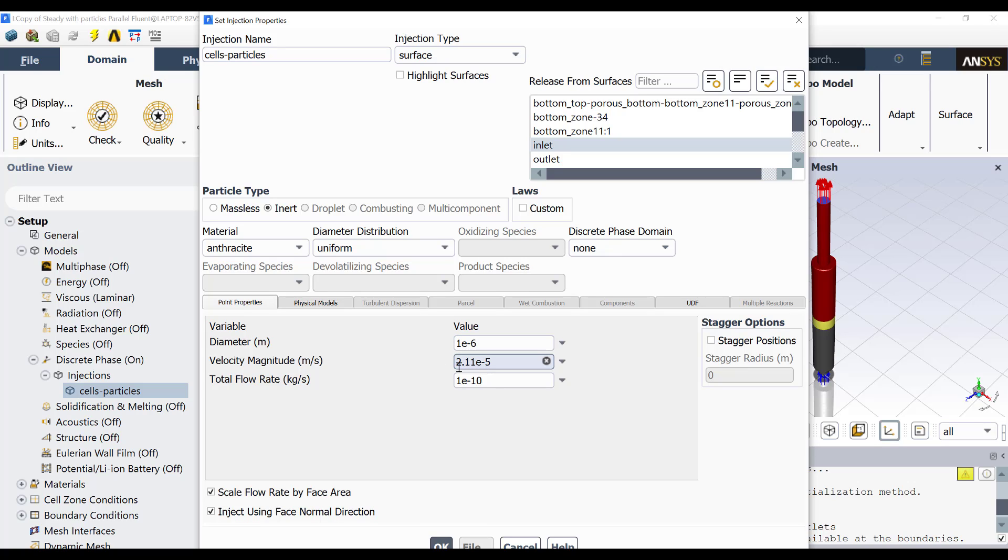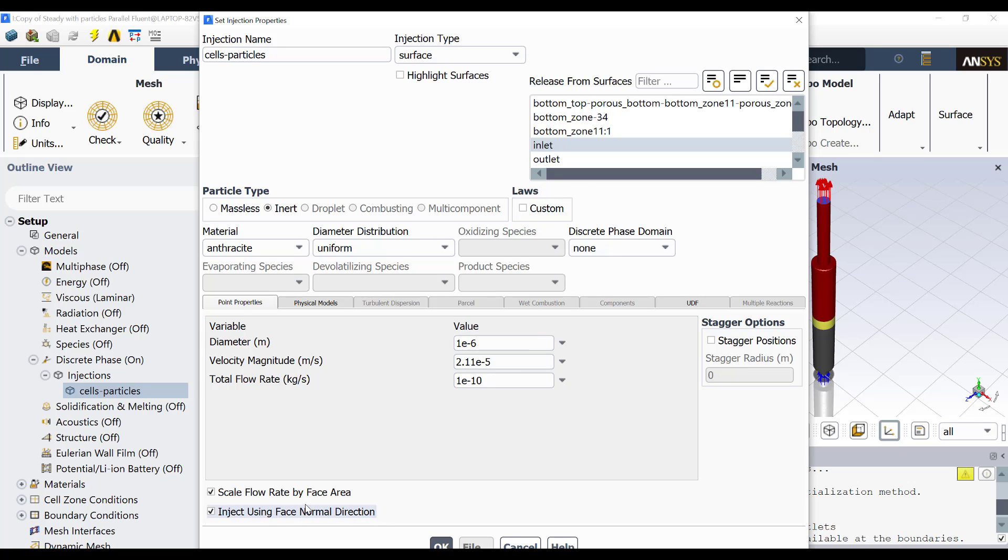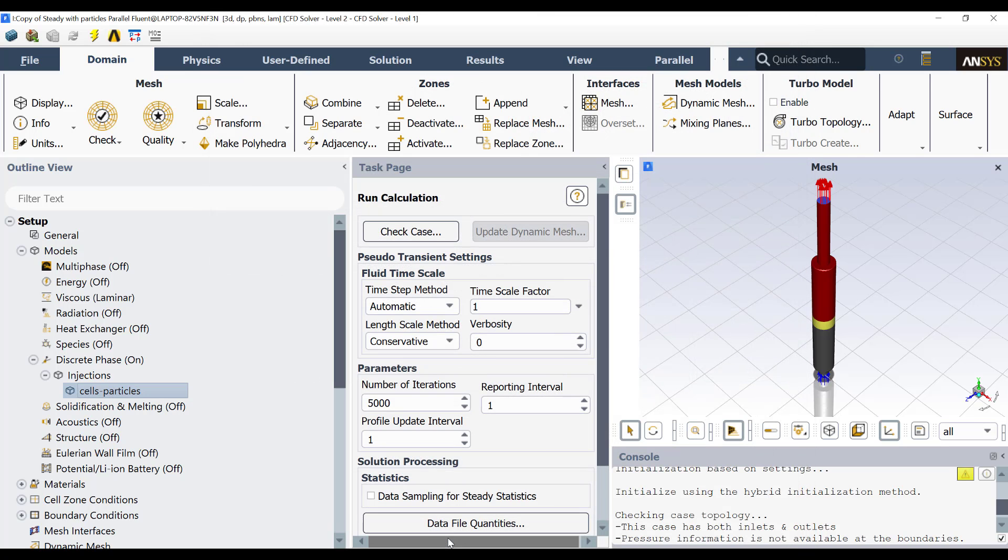The diameter of the particle is one micrometer. The velocity of injection is the same velocity of the fluid at the inlet. The total flow rate is this one. I am scaling the flow rate by the face area, let's say in the inlet. I'm injecting the particles using normal direction. Then the direction of injection is normal to the inlet.